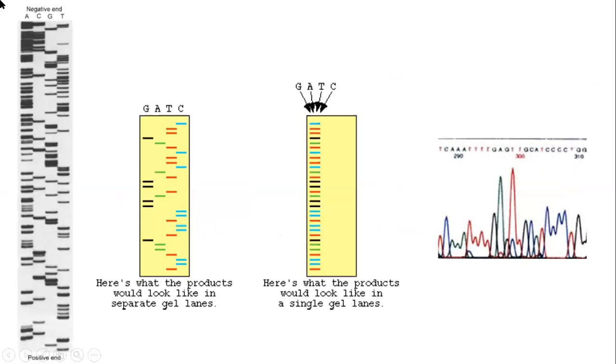So again, this is the agarose gel, done in the 1970s. You can see the length from larger fragment to smaller fragment, and the location of the AGCTs. You can run them separately based on this fluorescence tag, G, A, T, C, and then you combine them into a single gel, right? You take that, this is the first position, you go into the later position here, you add 1, 2, 3, 4, 5, 6, and the gel becomes one. This is the way it was traditionally done.